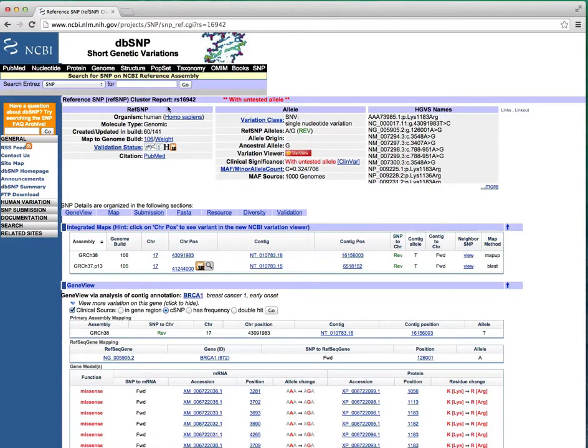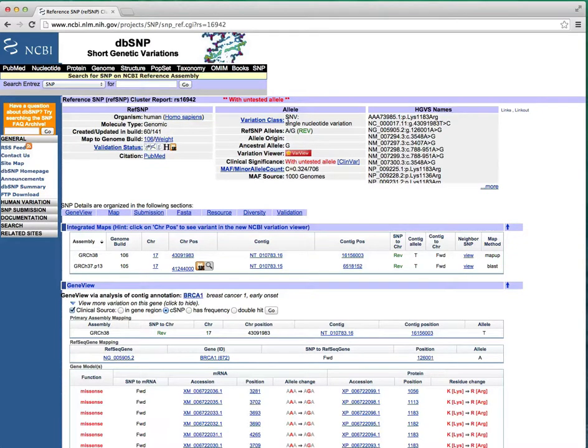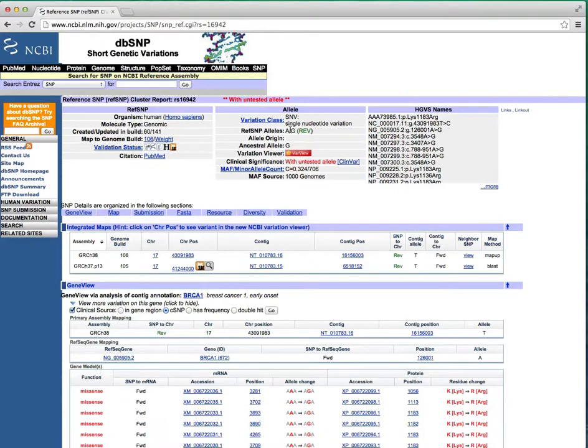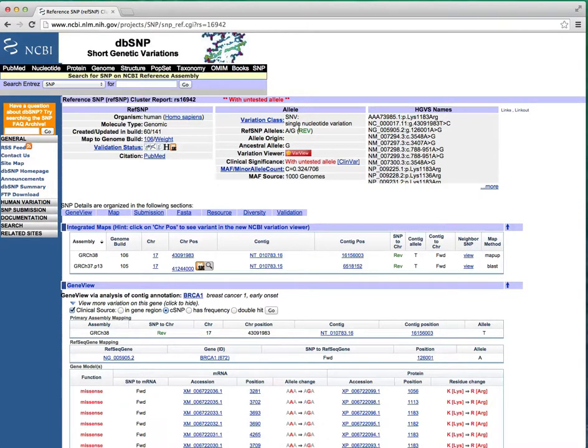Let's look at some key attributes of the SNP in the top table. This is a human SNP that is an SNV or single nucleotide variation. Its two alleles are A and G on the reverse strand, but I don't rely on dbSNP strand information as we haven't found it to be right all the time, so you'll want to validate that with another method.